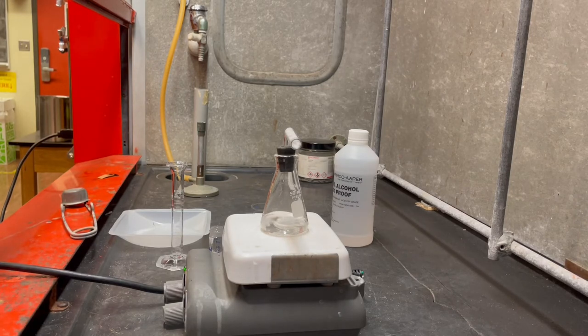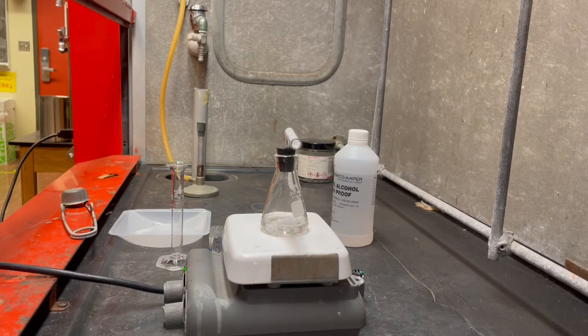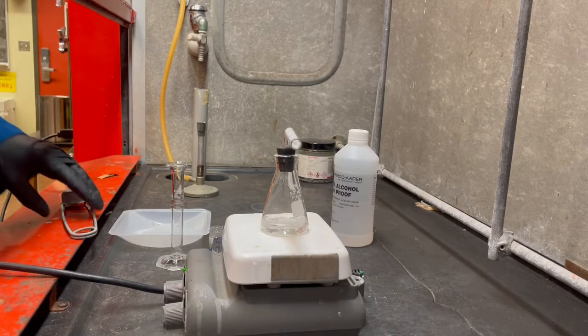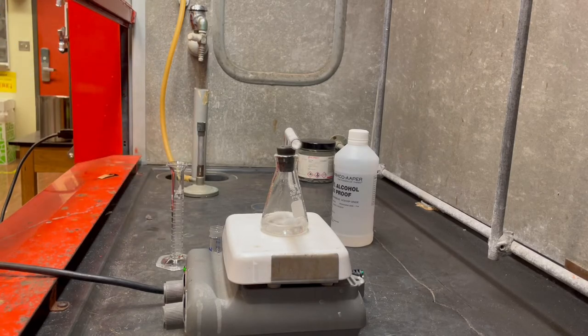So basically what I'm going to be doing here is just keeping an eye on the rate of the formation of those bubbles. For me personally, I know what's too fast and what's too slow. It just takes experience. That's why you guys aren't really allowed to do this. You need to get some more experience. And the first time I ever really messed with a significant amount of elemental sodium was in grad school.